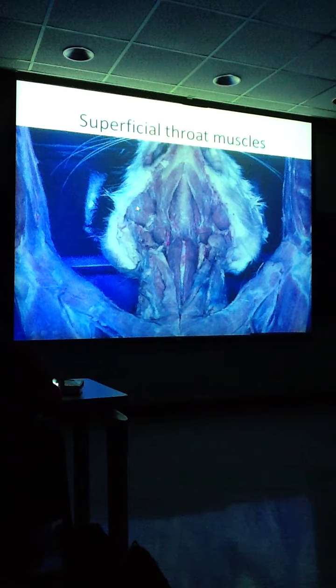Masseters. If those are masseters, I got these cute little muscles right here, Mr. Gilmore, that follow the angle of the mandible. That muscle, Mr. Gilmore, is going to be digastric. But Mr. Gilmore, I got some muscle that goes underneath there, right there. The fibers go straight across. His name is mylohyoid. Do it again, Mr. Gilmore. Mylohyoid.